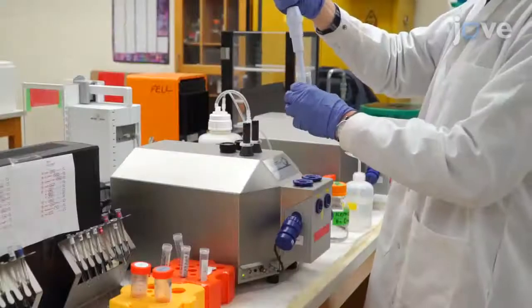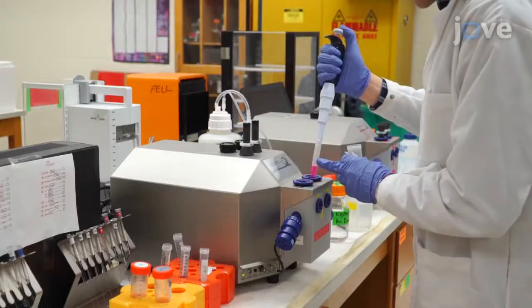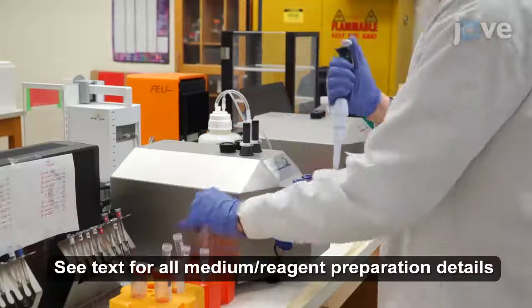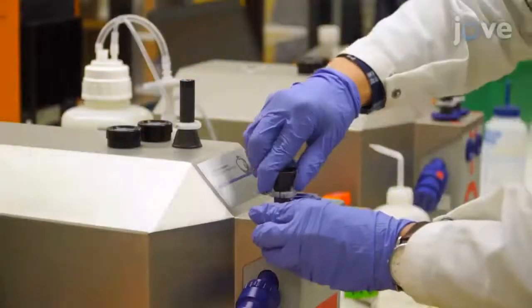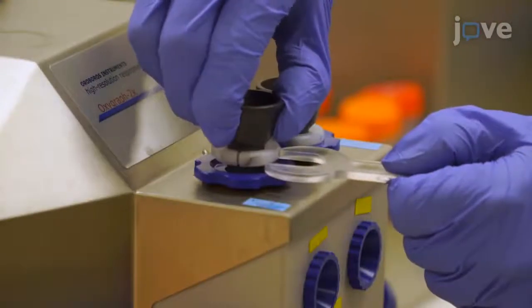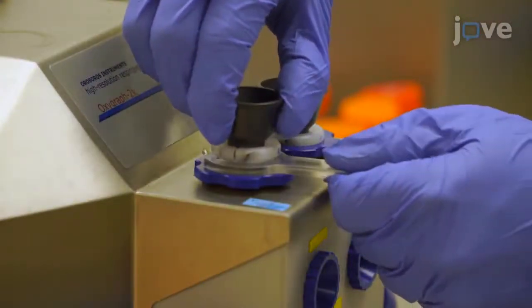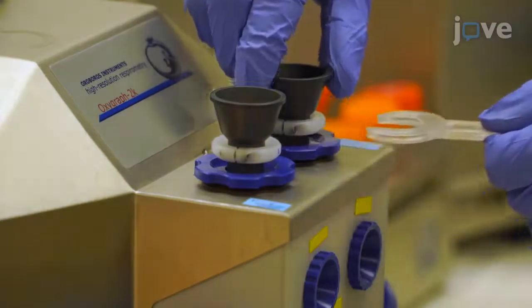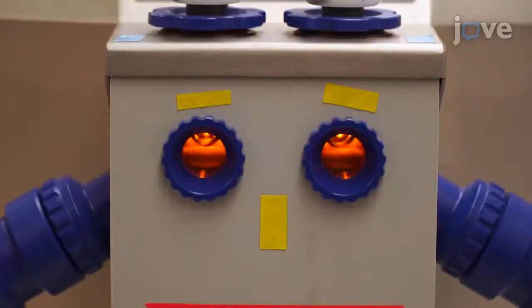To prepare the respirometer, first add 2.2 milliliters of DMEM to each respirometer chamber and fully insert the stoppers. Adjust the stoppers with a stopper spacer tool to allow optimal oxygen diffusion to the medium, and set the chambers to continuously stir the samples at 750 rpm at 37 degrees Celsius until the oxygen concentration and the oxygen flux are stable.